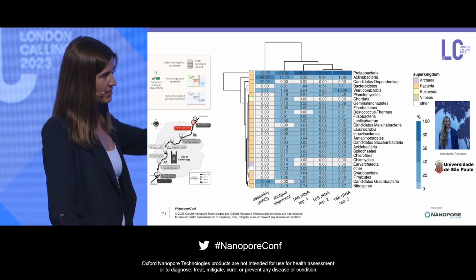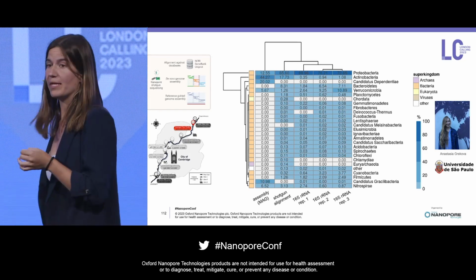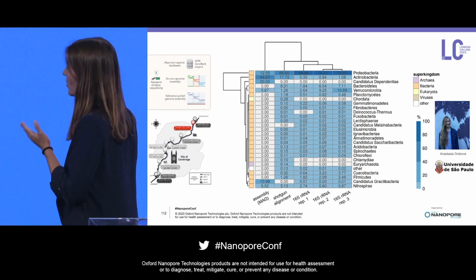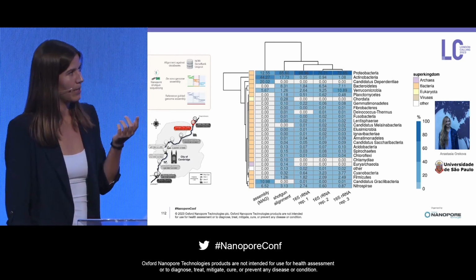And here, on the taxonomic phylum level, you can already see huge differences between the assembly-based approach and the other approaches in terms of quantification of the taxa. But that obviously makes a lot of sense, because for the assembly-based approach, we only really find the high-confidence, so probably highly abundant taxa.